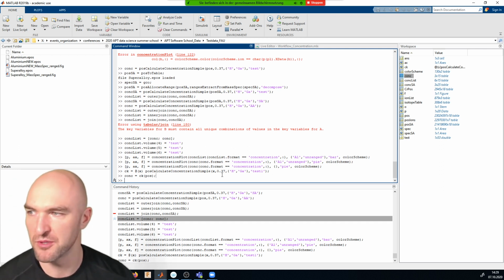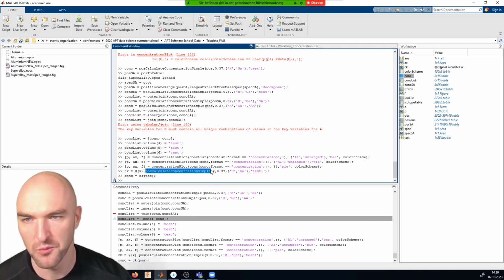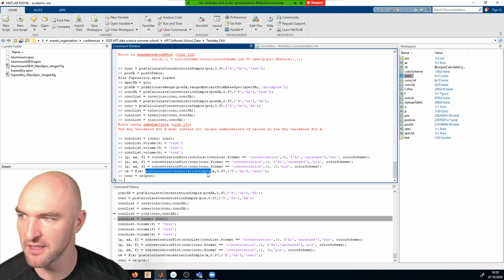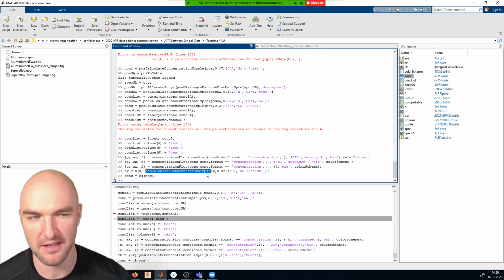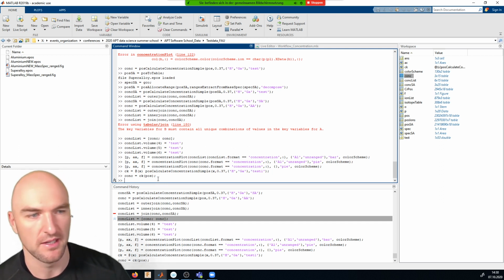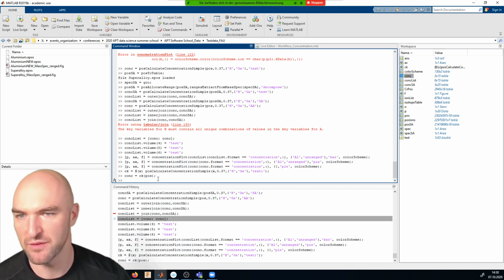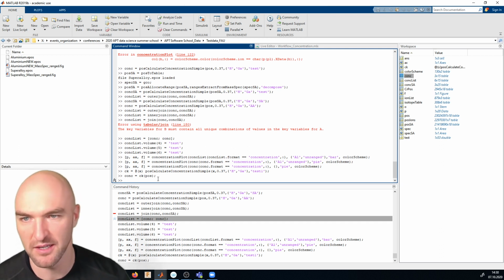And I think one of the most interesting things to do in this case would be to have a deconvolution concentration kernel, where we take the programs that Andy London and the guys in Aachen have written, and take that and create a concentration determination program that allows us then to have deconvolution in voxelization, so that your isosurfaces become more accurate, or that our proxygrams take care of any deconvolution functions that we might wish to use in that case.